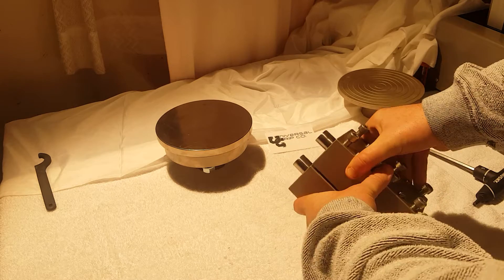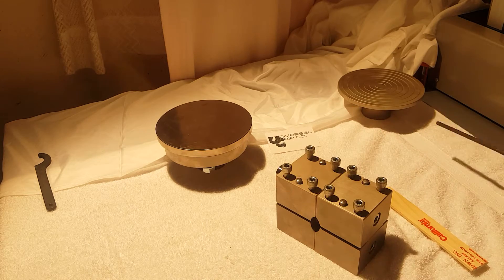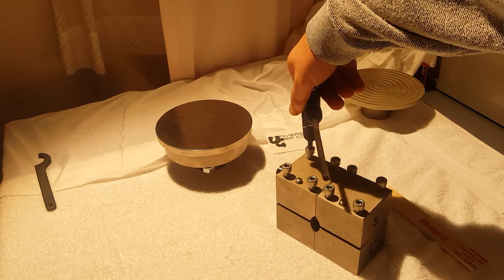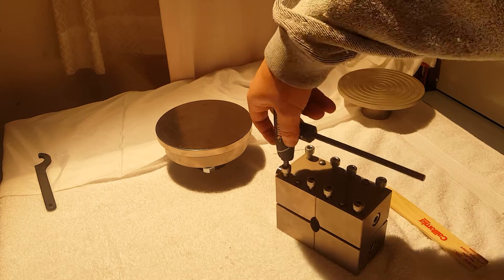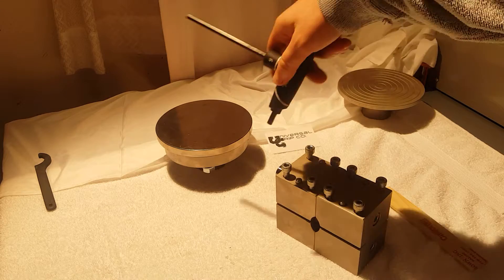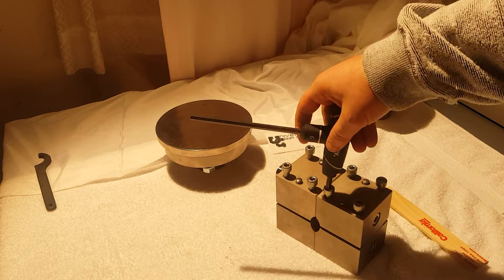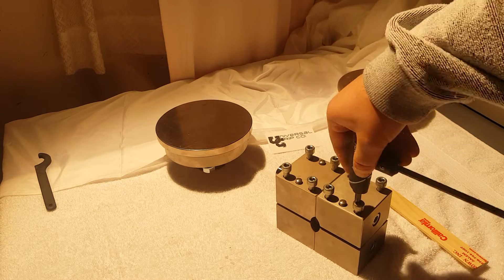First, let's unscrew some of these tightening screws on the side. It's important to tighten and loosen all the screws uniformly so you won't damage your fixture. This is similar to the pattern you would use for changing a car tire or something of that nature.